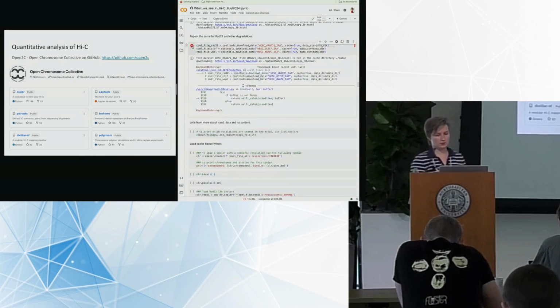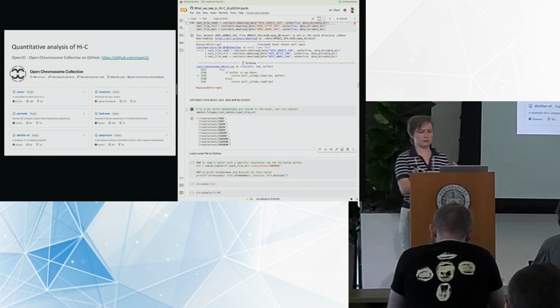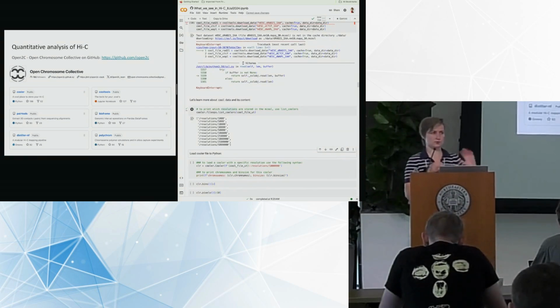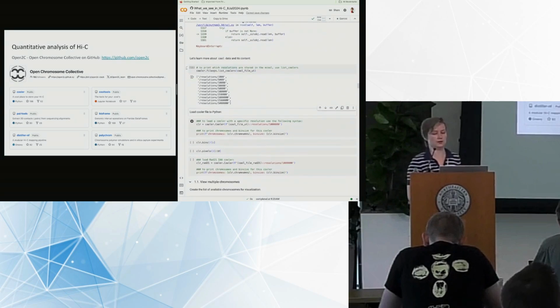While we are all waiting for this download, I will stop it. You cannot stop it. I just want to proceed and show you the cooler structure, and I will run the download further. You can just proceed with what you are doing right now, and just look at the screen following what I will tell you about cooler files.